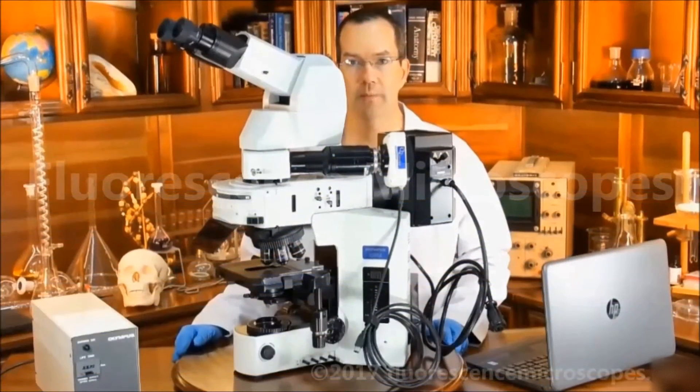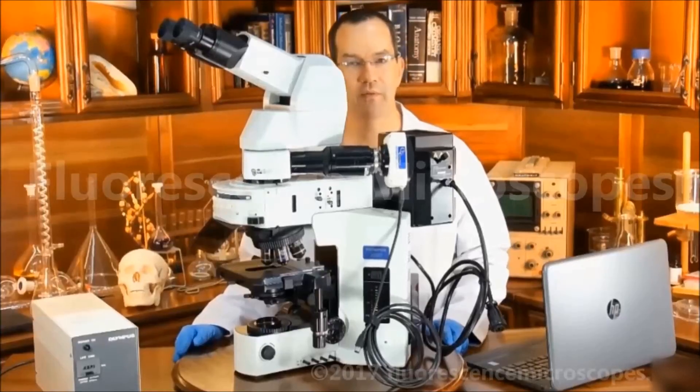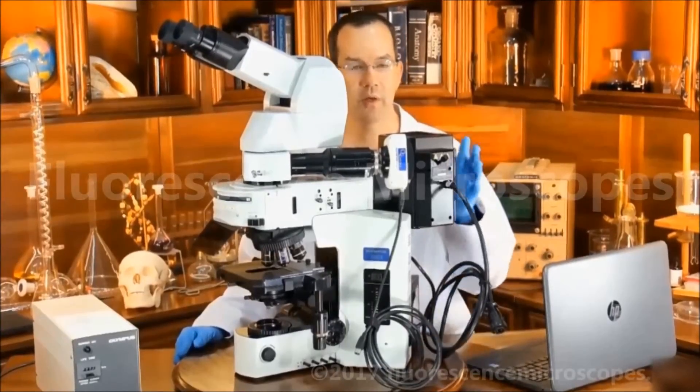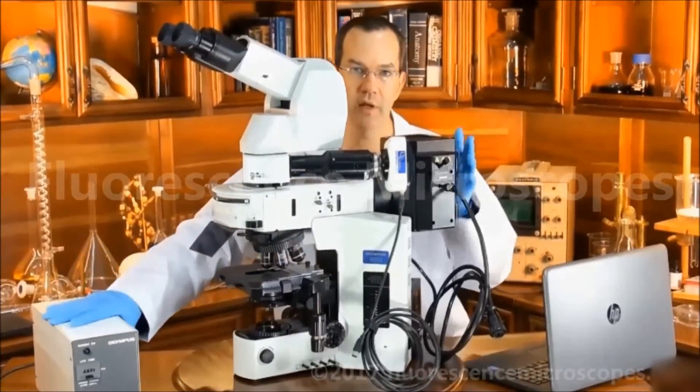This is an upright Olympus BX51 fluorescence microscope. We've configured this particular unit with a 100 watt HBO mercury illumination system. This is the power supply for it.